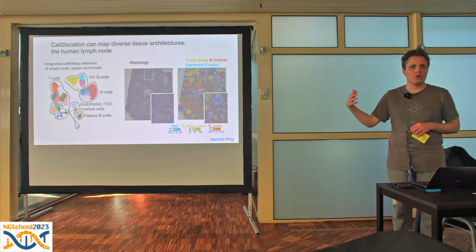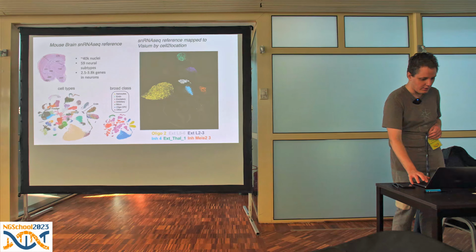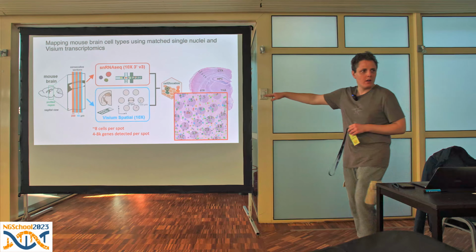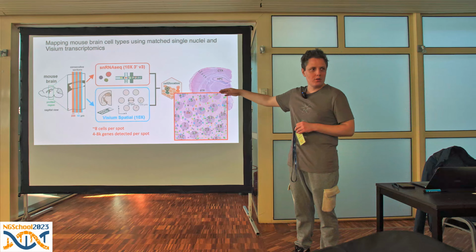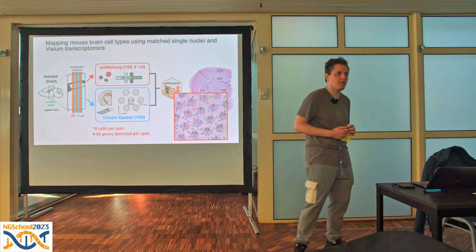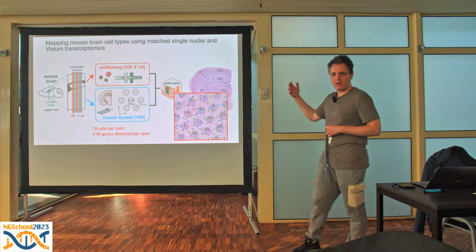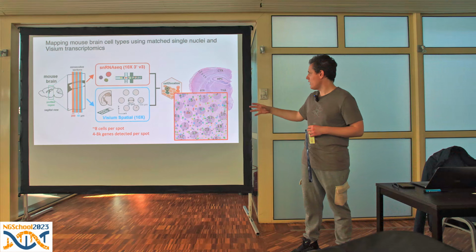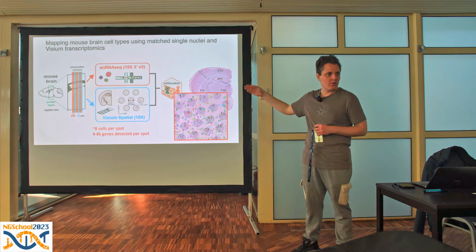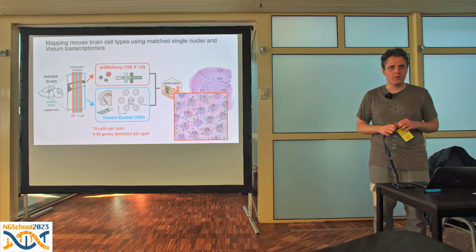You might also have your own data, so you want to combine. One of the things that is quite valuable, I think, is that you can have your own data generated in this setup, but maybe not as much data as you would want. So in this case, we did 8 sections. Out of them, 5 worked, and 5 sections had 40,000 cells. And maybe there is an atlas with 500,000 cells. So you may want to combine them to both help you annotate and find more rare subtypes in your 40,000 cells. But also to improve the annotations.